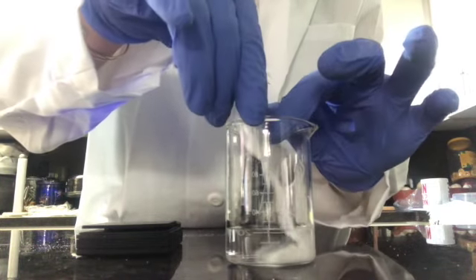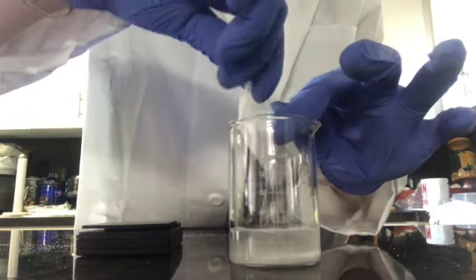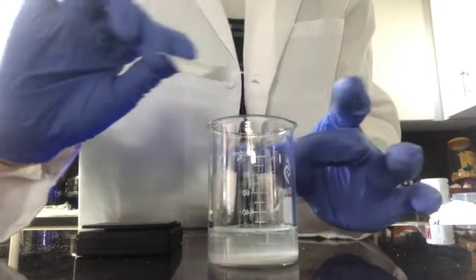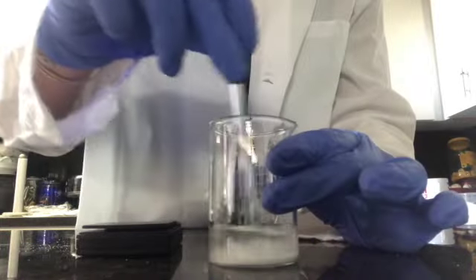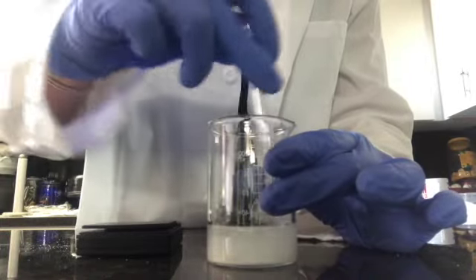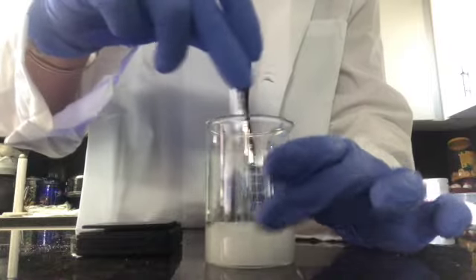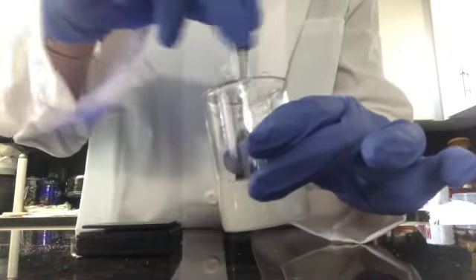Measure the calculated amount of sodium carbonate and carefully add it to the 25 milliliters of distilled water in the second 100 milliliters glass beaker. Use the stir rod to stir the sodium carbonate and break apart any clumps until it is fully dissolved into the water.